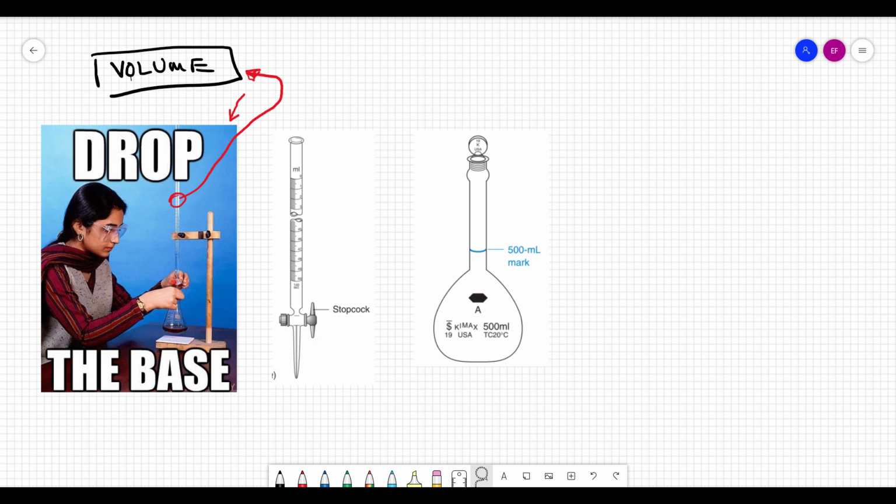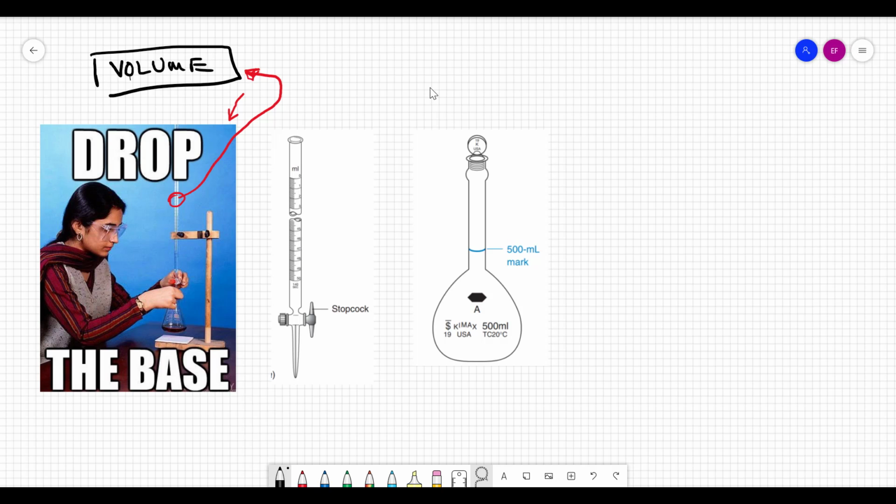And another enormously valuable tool that you'll actually use in your lab kits, but it's just a standard in the chemist's toolkit, not just the analytical chemist, but any chemist, would be this thing called a volumetric flask. So a volumetric flask, and all of you have used this before if you took Gen Chem here, but you may not have thought through the details. This is another precision blown piece of glassware. It's expensive. And the benefit of a volumetric flask is it has a pre-inscribed mark that very accurately determines what the volume of a solution will be inside of it.